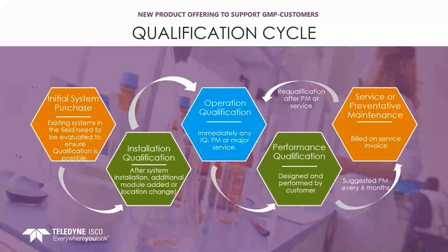And then we suggest a PM every 6 months, but this could be variable depending on usage and whatever your standard protocols are for your site and the instrument and how it's being used. But anytime after a PM or a service that our service or distributor is performing, you would then do requalification of the instrument with an OQ again. This would happen after any PM or service. And so you go into this cycle of repeated qualification over a set period of time.